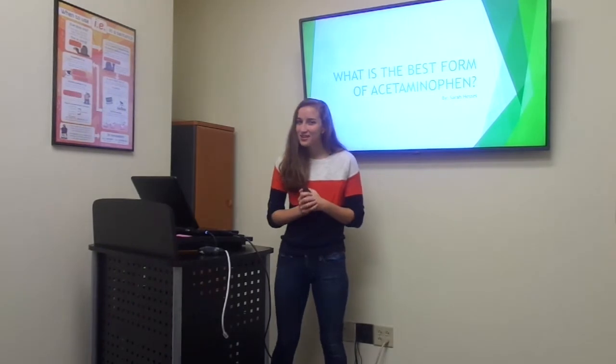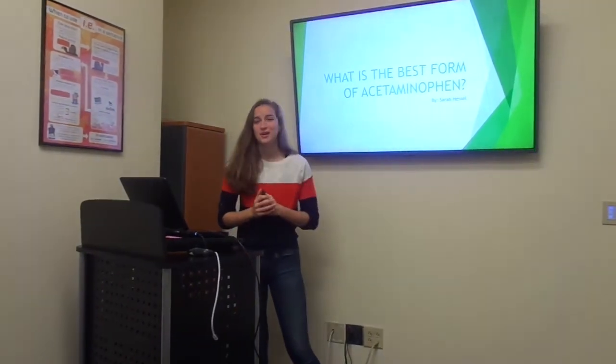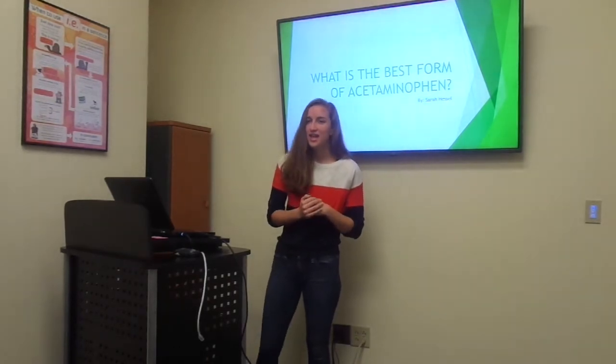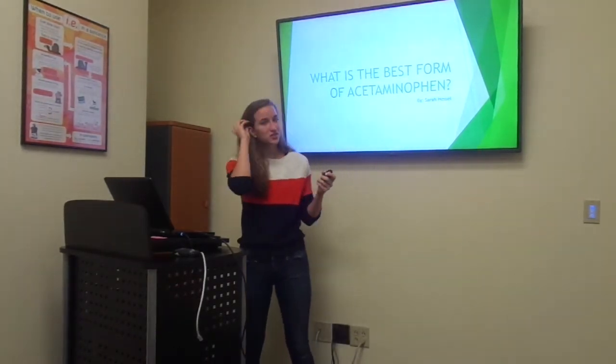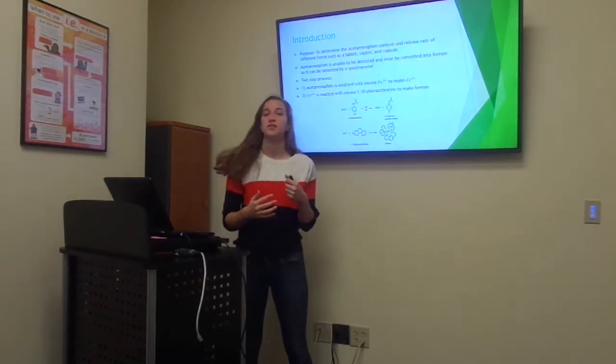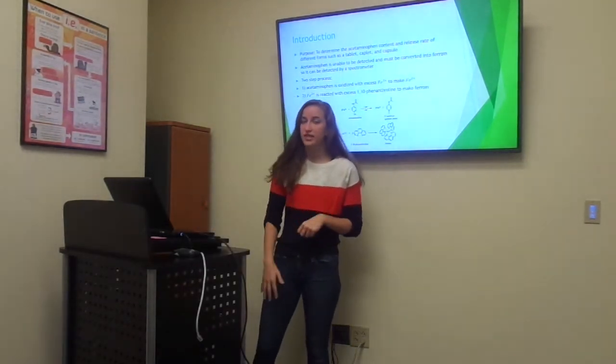My name is Sarah Hessel, and I'm here today to talk about what is the best form of acetaminophen to take between the caplet, tablet, and capsule. So to figure this out, we want to determine the acetaminophen content and rate of release for each of those three forms.